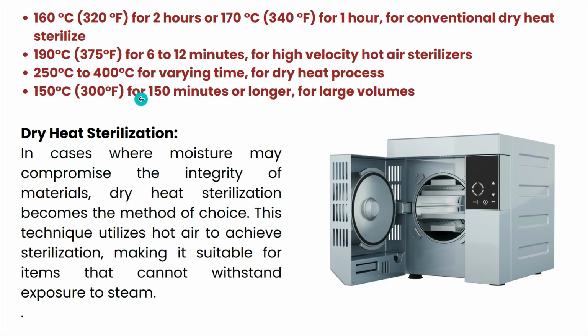Along with this, there is another means of physical sterilization, that is dry heat sterilization. Dry heat sterilization is usually practiced when you wash the glasswares and you keep them so that under dry heat with high temperature the glasswares get sterilized.